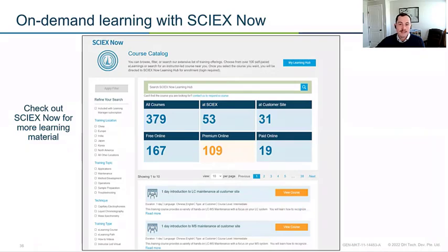If you're interested in more of the maintenance courses, say you really want to learn how to do a front-end cleaning, I encourage you to check out SCIEX Now. They have great videos that go through step-by-step from removing the QJet, disassembling it, cleaning the lens, all of that can be found here. So go ahead, sign up. Those courses, I believe, are free, so they can be a really great resource.